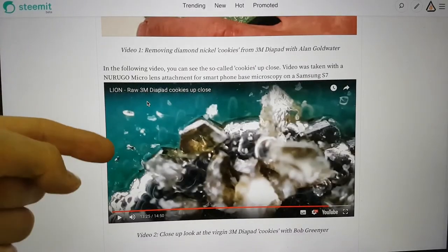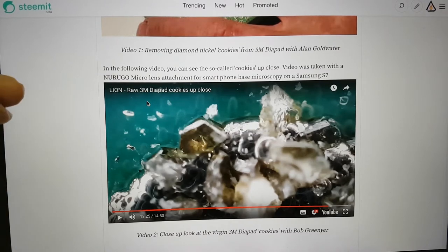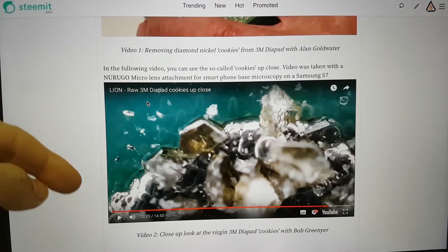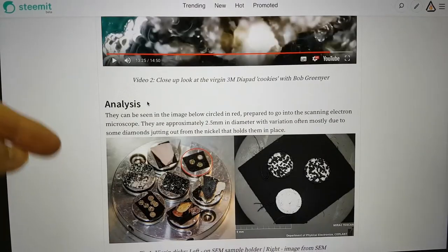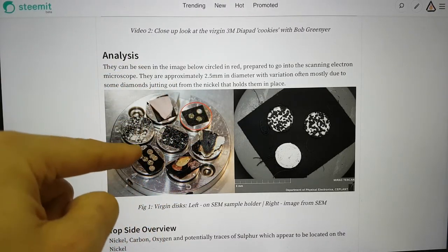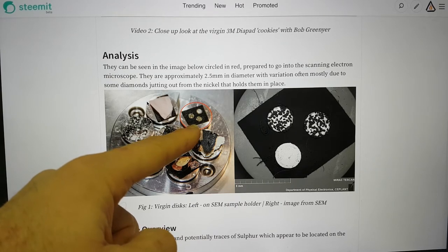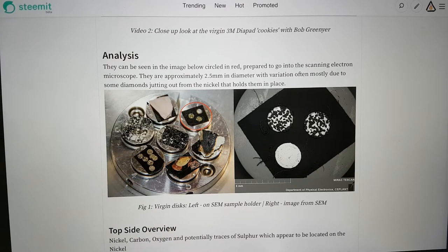We've included very close-up microscopy, color microscopy videos and then we drop right into the analysis. This was the table in the SEM at Maserick University and this is the sample that we are referring to in this video which is three discs.